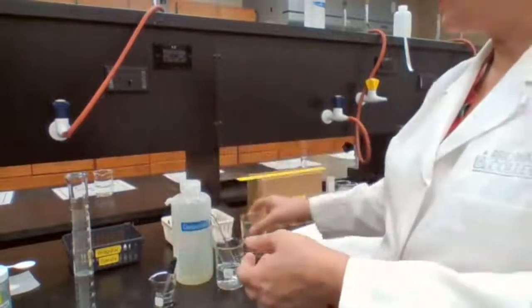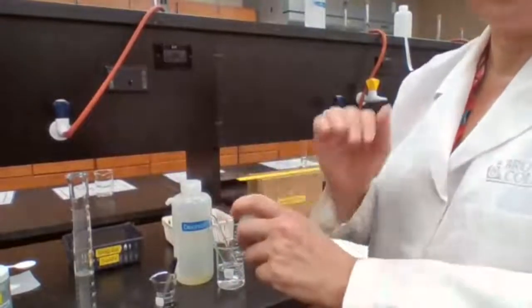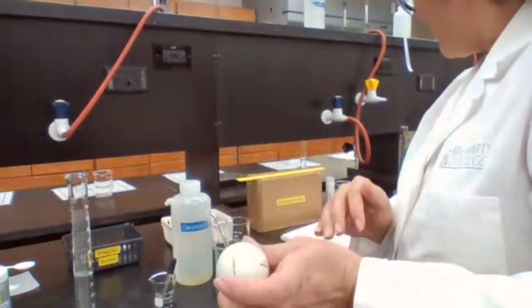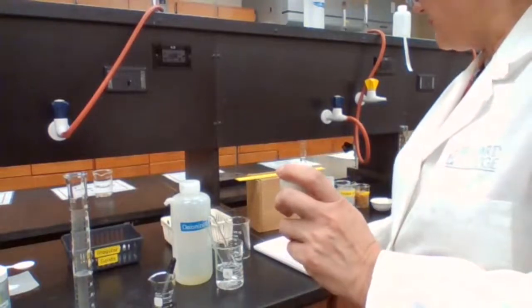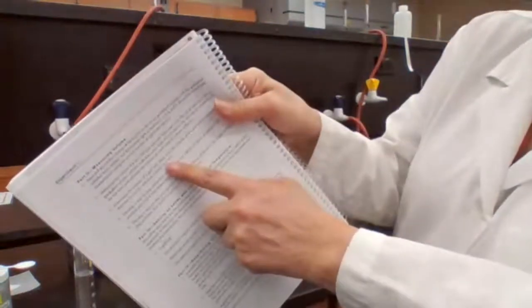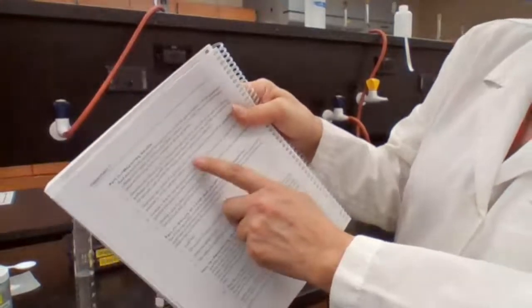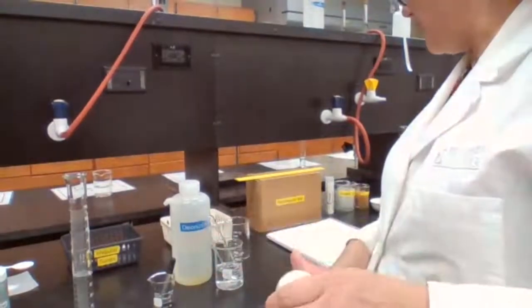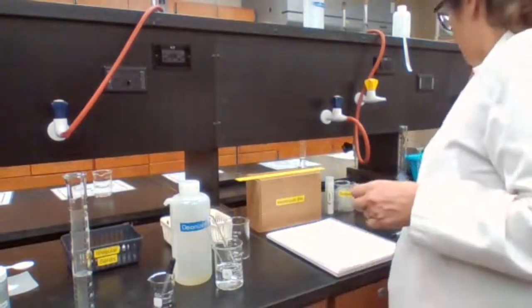The better way is to find the diameter of the golf ball. When you have the diameter, you divide by 2. You get the radius of the golf ball. And when you have the radius, then you use the formula for volume, 4 over 3 pi r cubed. So all you need for this part 2-3 is the diameter of the golf ball.